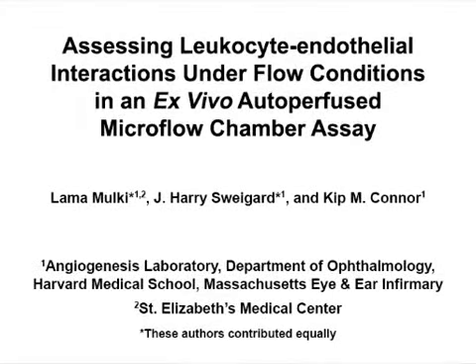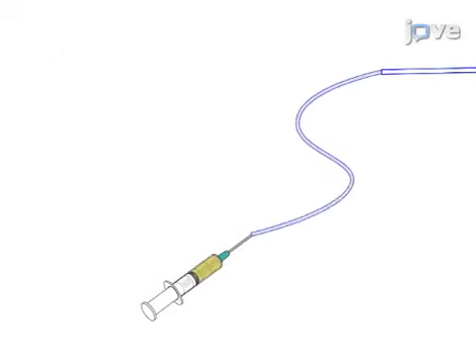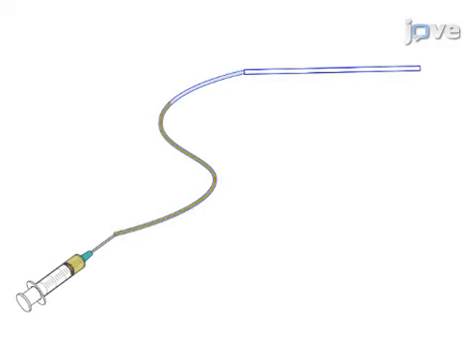The overall goal of this procedure is to create an ex vivo arteriovenous closed circuit to assess leukocyte interactions with endothelial adhesion molecules under physiologic flow conditions. This is accomplished by first coating a thin glass chamber with the endothelial adhesion molecule of interest.